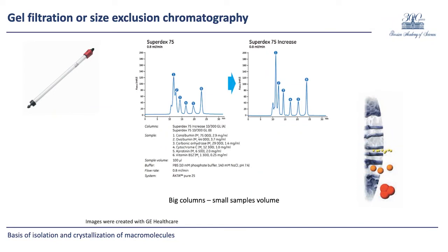They elute first. Medium-sized molecules are placed in the pores of the sorbent, but not completely. Therefore, their retention volume is slightly higher than the free volume. They are eluted second. The smallest molecules freely enter the pores together with the solvent molecules. Therefore, their retention volume in the column is much higher than the free one and approaches the total volume of the column. They are eluted last.